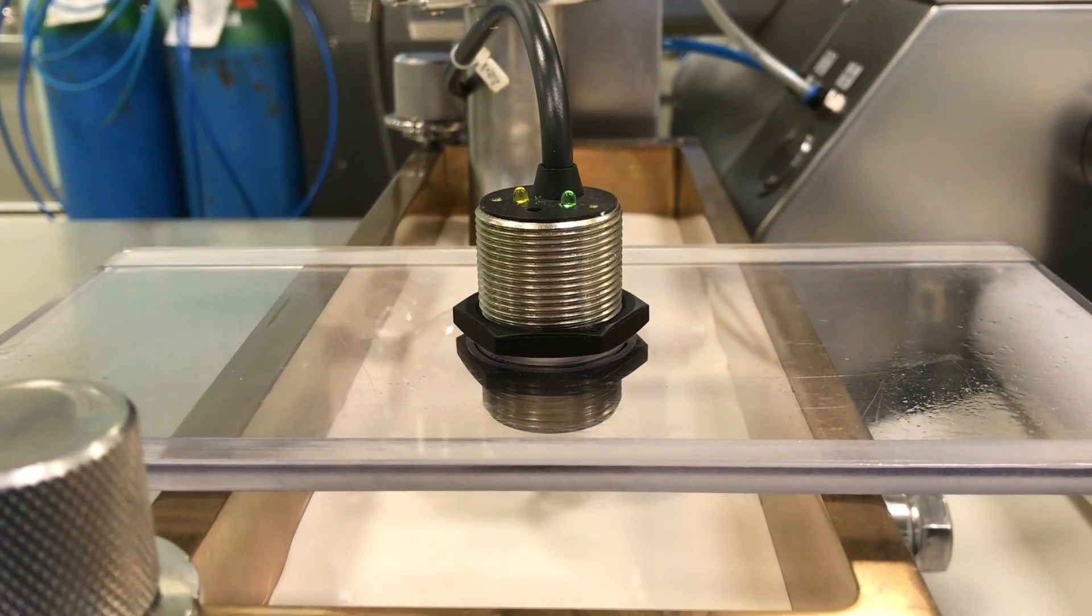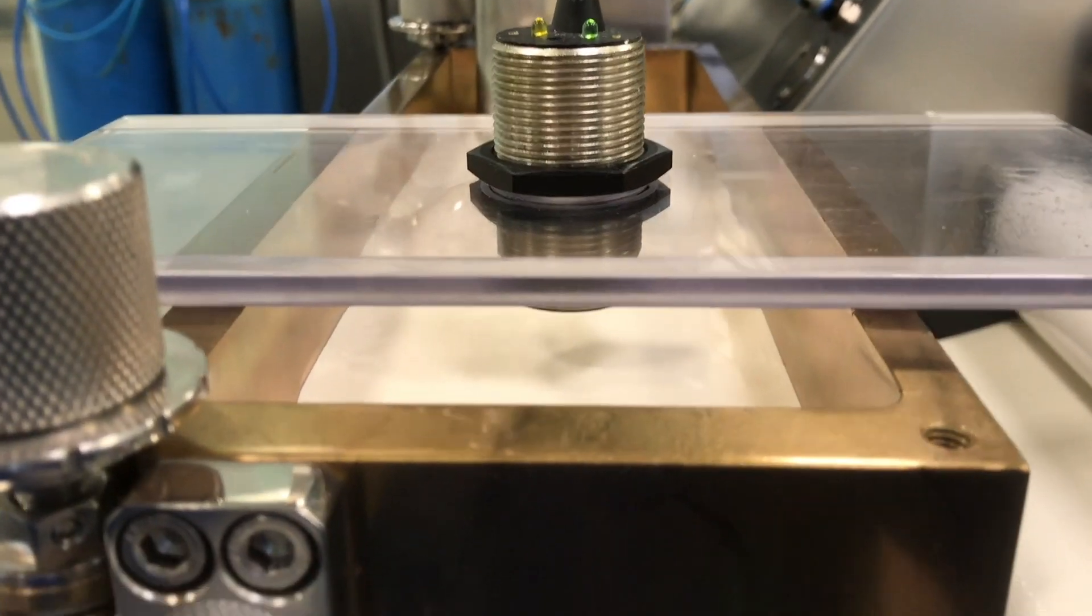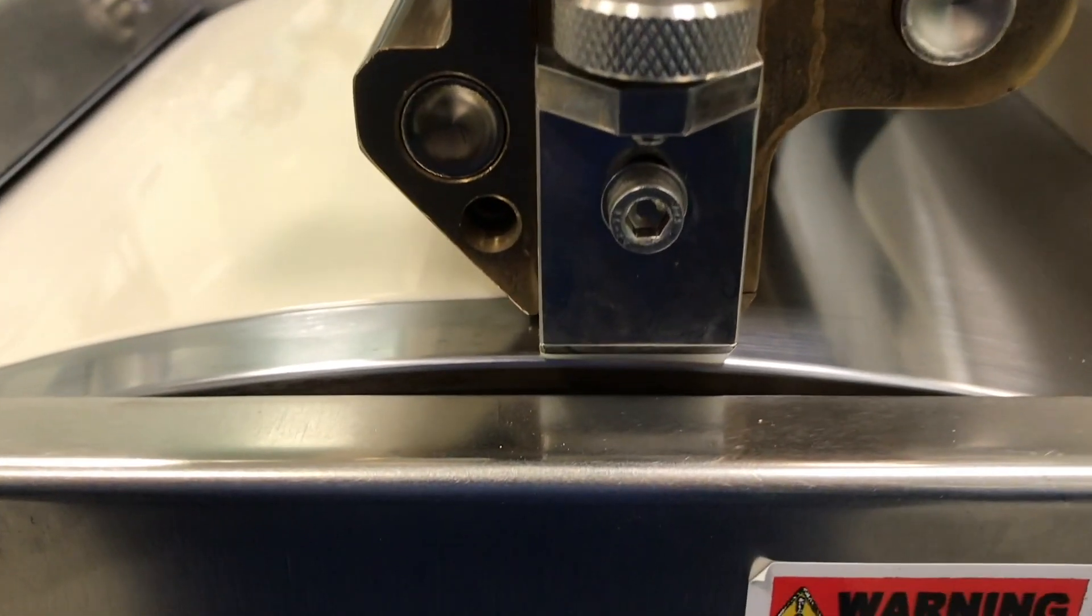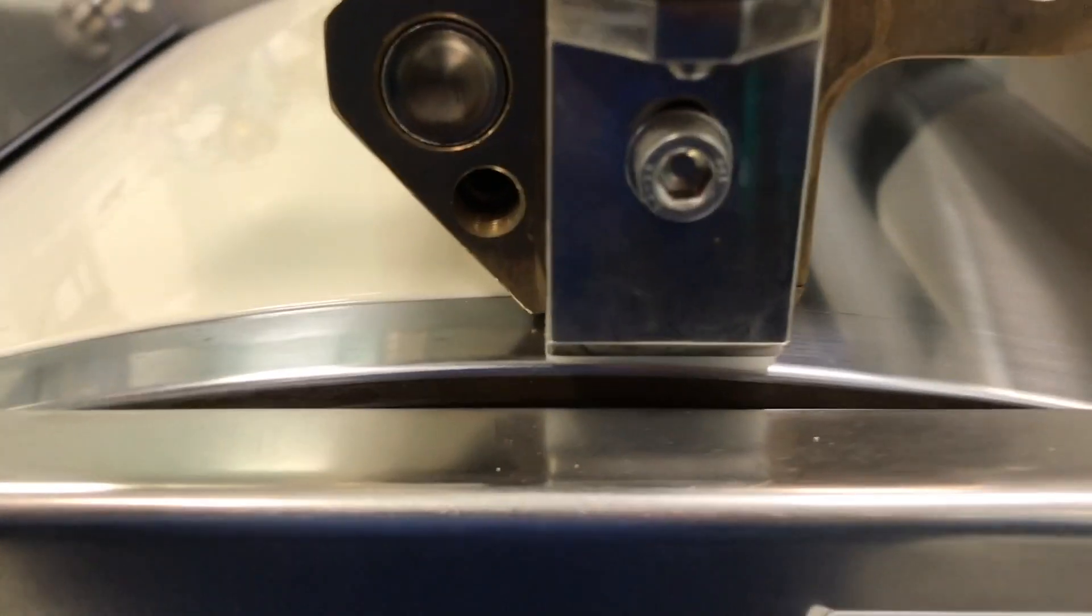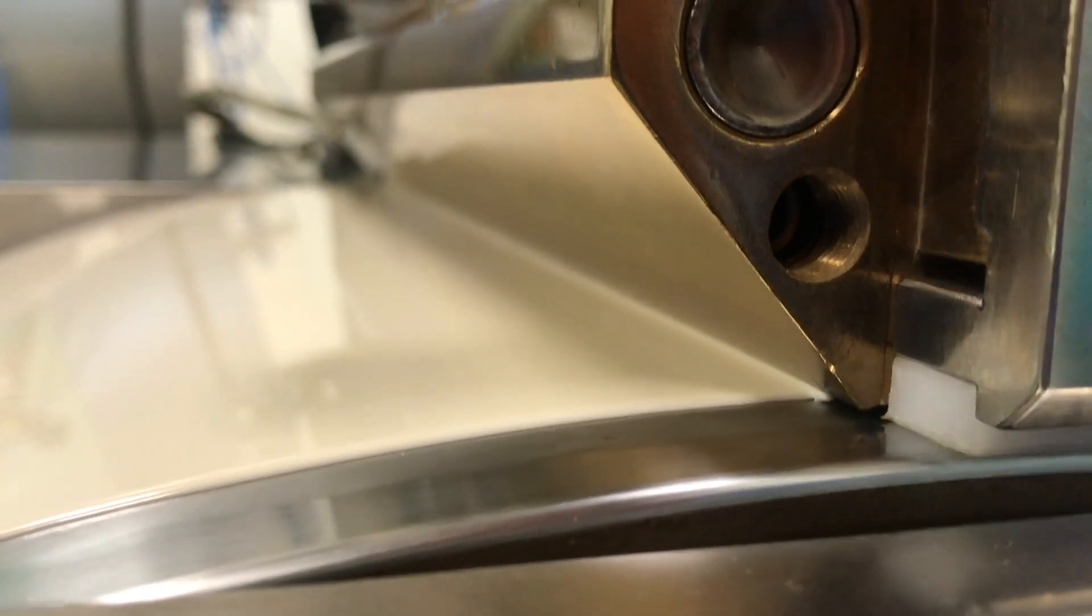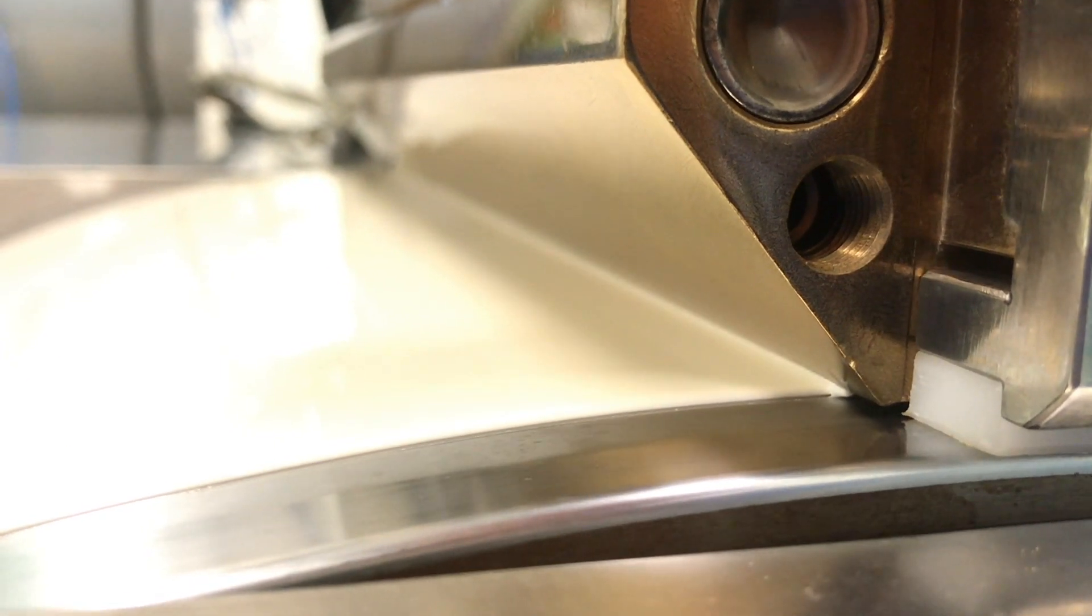Now this is the white gelatin mass we've just seen in the spreader box. Here it is 60 degrees and it is cast onto the cooling drums which are 20 degrees with a very thin ribbon. This ribbon is elastic and can be conveyed onto the metal parts of the encapsulation machine.